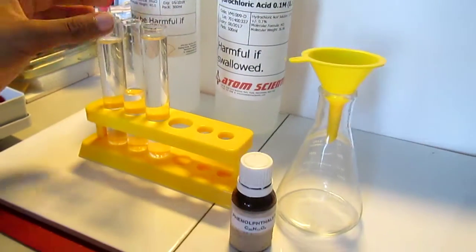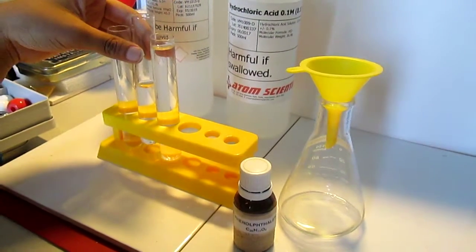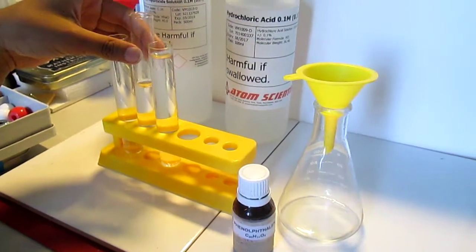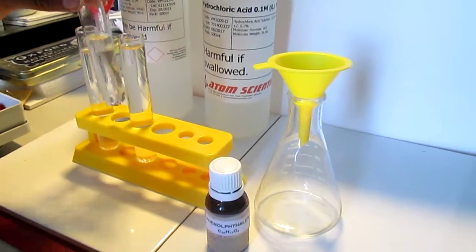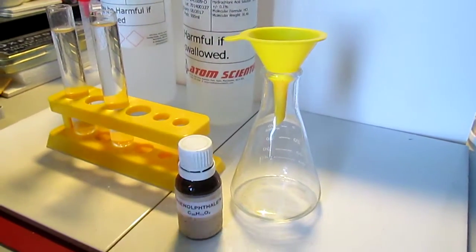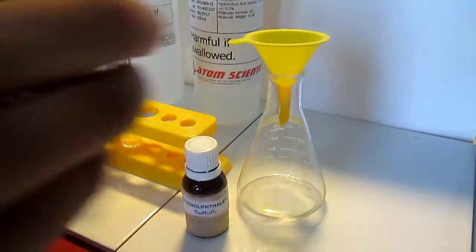You first pour the sodium hydroxide into a conical flask. You can see that it is a clear colorless solution.